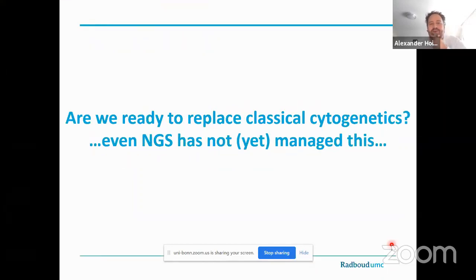What the essence of my talk, or our own interest in optical mapping and Bionano, is a very simple question. Are we ready to replace classical cytogenetics? Well, being aware of the challenge that even NGS, which I truly embrace, and a lot of us do, obviously, even NGS has not managed that yet, simply because there are some particular aberrations in cytogenetics that are really tough to detect by sequencing means. So the next challenge is now to see whether other techniques could potentially do that. And in my very own opinion, I think optical mapping at least gets us a long way already.